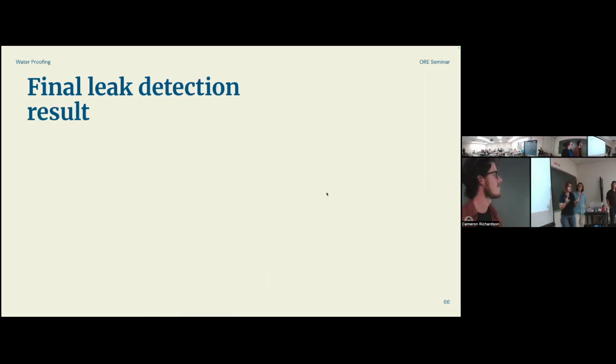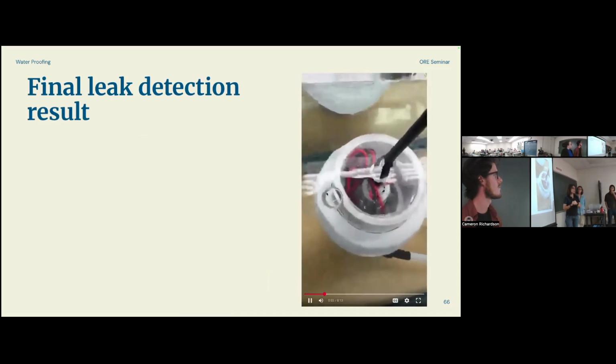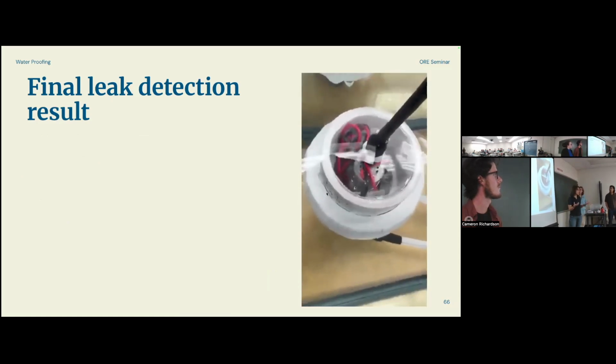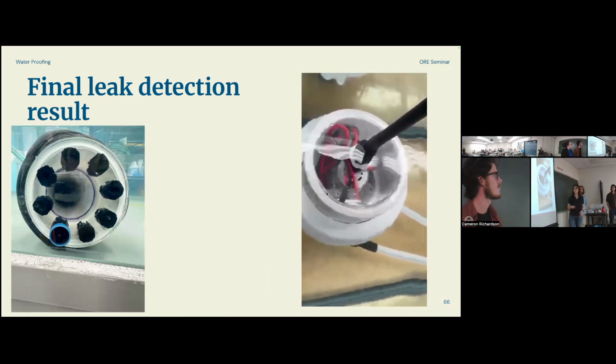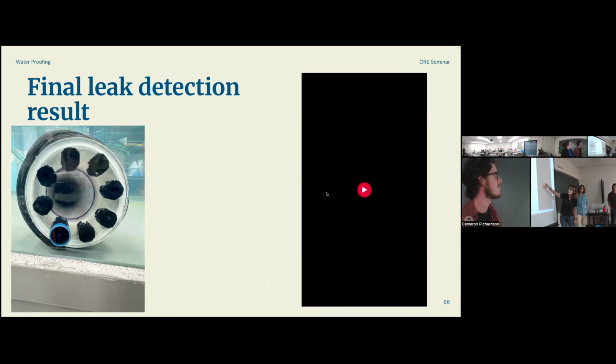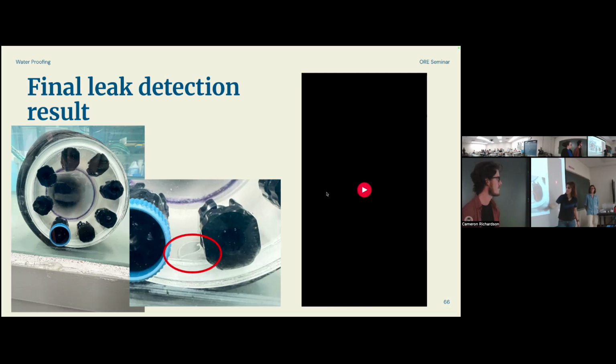We have water inside of the union, but we didn't have water inside of the pump housing. So we should find where this leakage is. Here in this video, you can see clearly the air bubbles that came from here, the epoxy glue that was between the plate and union. And in this picture, you can see the water inside of the union up here.